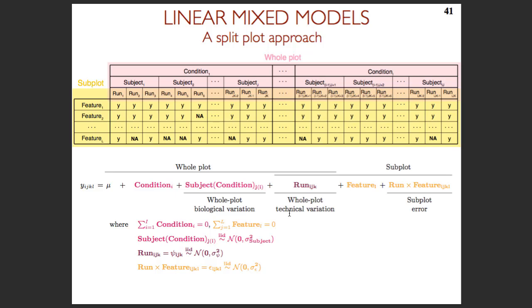But what we will do, we will replace it with a two-step procedure, where first we will summarize all the features in one number per protein per run, and then we will fit the right model across conditions. And this is what MSstats is doing. This would allow us to treat censoring, outliers, missing values in a very general way. To us, it was really a qualitative shift in the way we think about these problems, because many people thought about censoring and so on in LC-MS workflows, but in my view, this is the approach which allows us to very generally accommodate a very broad variety of experimental designs in a way where the users do not have to worry about this too much.